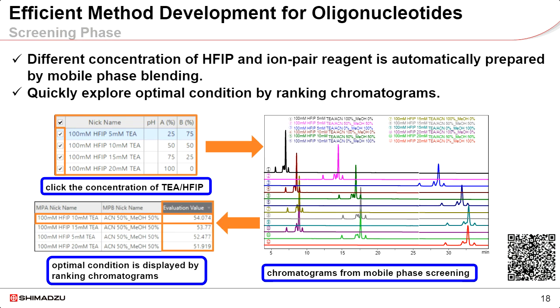Let's look at another use case where solvent blending becomes an important feature. When we think about the development of methods for oligonucleotide separations, oftentimes there are additives used, either ion pairing agents or things like hexafluoroisopropanol, that are not the easiest solvents to work with. They oftentimes leave behind residues on systems or have challenges with compatibility with flow path parts and materials.